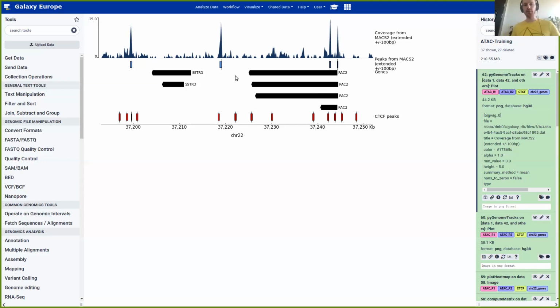And so this goes then into the further peak analysis which you would do. So with that, you see it's very important to look into your data again within a genome browser to confirm some of the sites and to answer your biological question.